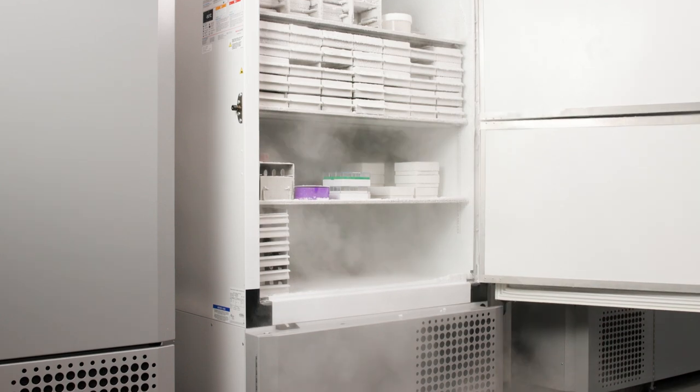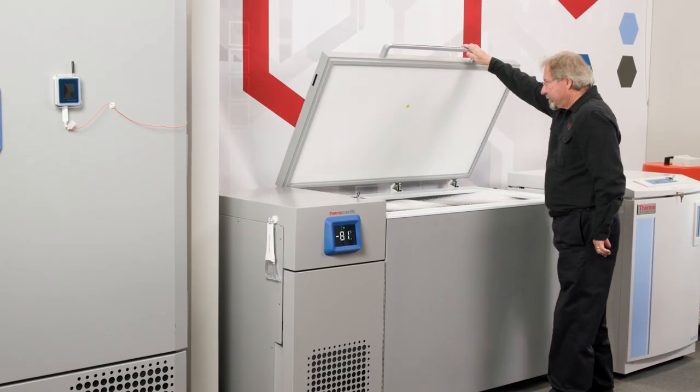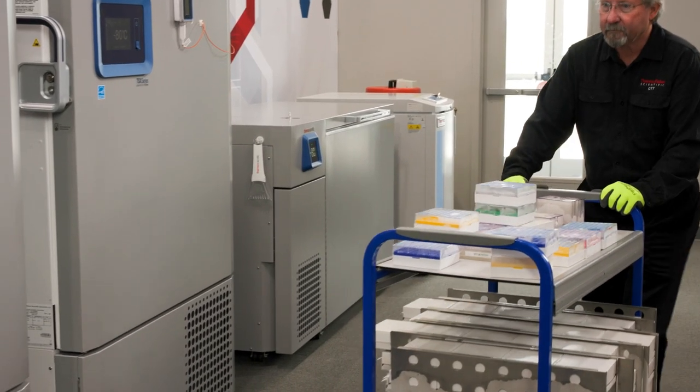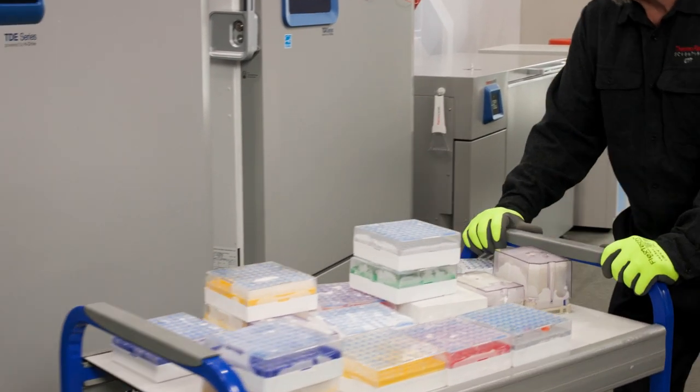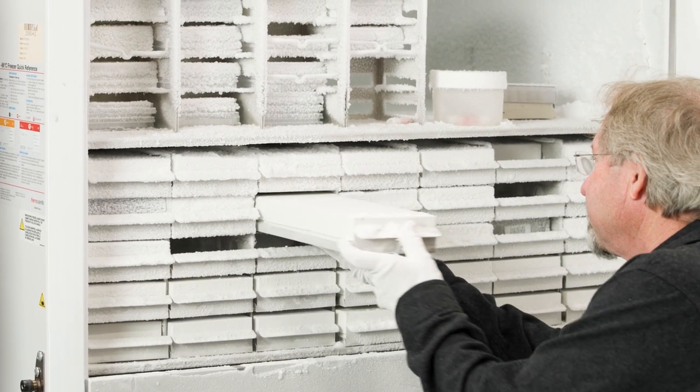Will the location allow for proper installation and airflow and space to open and close the door? How about making room for sample carts? To keep your samples safe, you'll also want to be able to quickly access them and minimize the time that the door is open. Next, you should consider the types of samples you'll be storing.